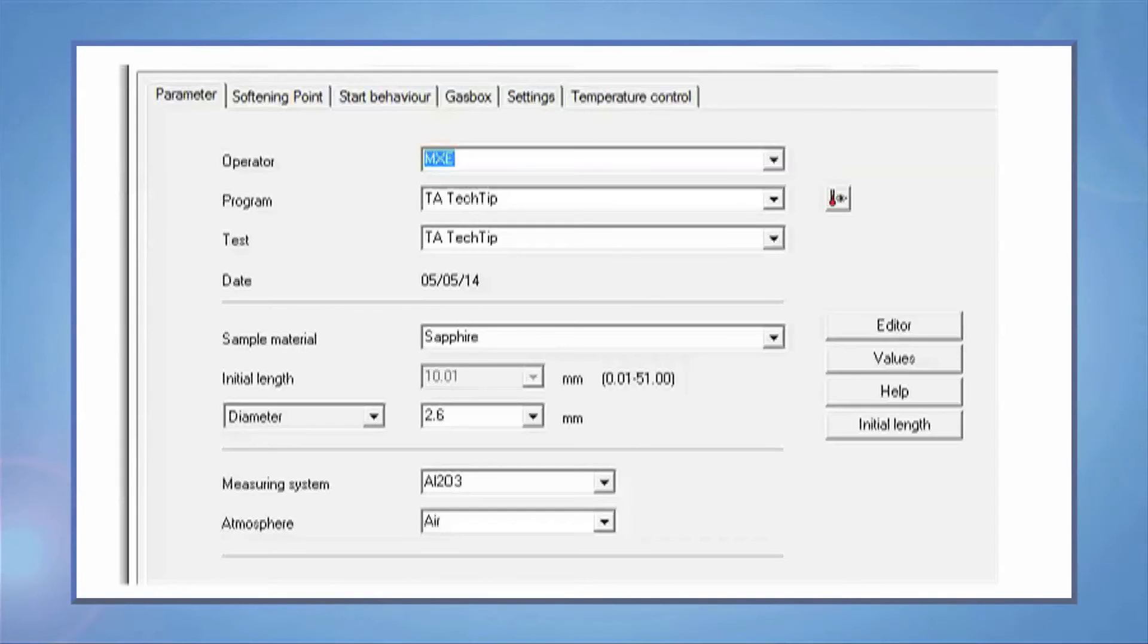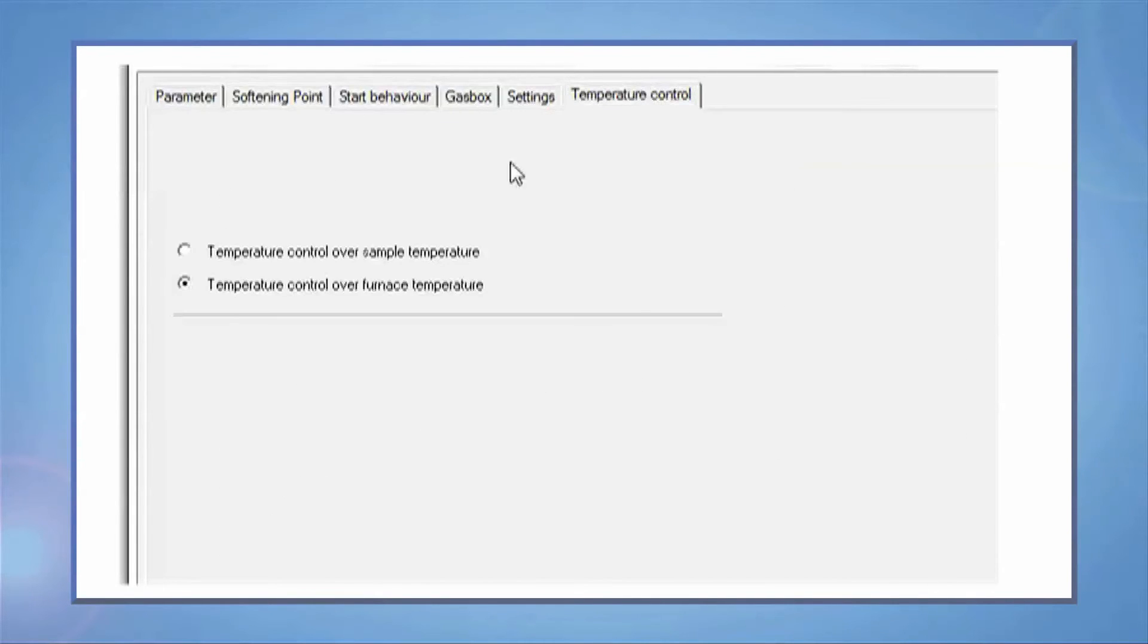For most experiments, you will need to select the furnace temperature on the Temperature Control tab.